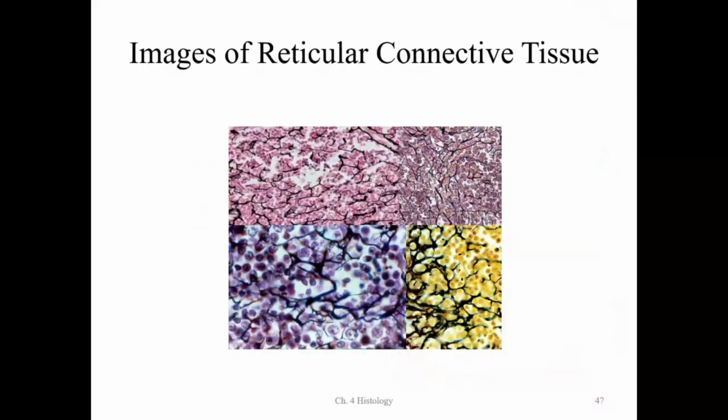Now, when we look at it, one of the two big things is we have these reticular fibers here that we're looking at. These fibers are reticular fibers. Reticular references that it's a lattice. Reticular basically means it's a lattice work, okay? And so we have all these reticular fibers that we can see in this. All these little black lines, that's reticular fibers.